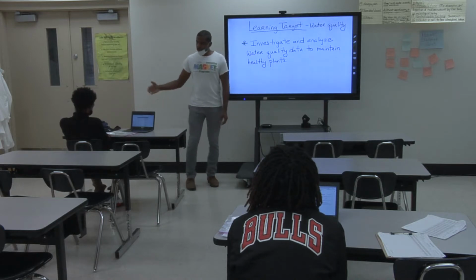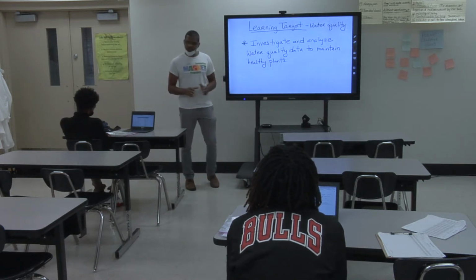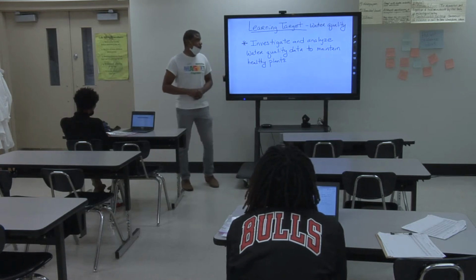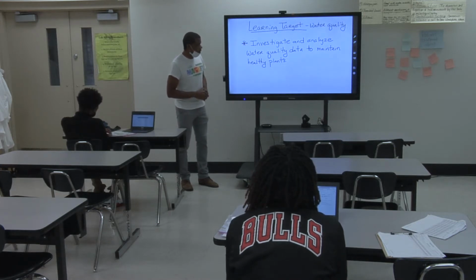All right, class, today we're going to do our weekly water quality testing just to make sure our plants are healthy. So before we go in the lab, let's look at our learning target for today. We're going to investigate and analyze water quality data to maintain healthy plants.